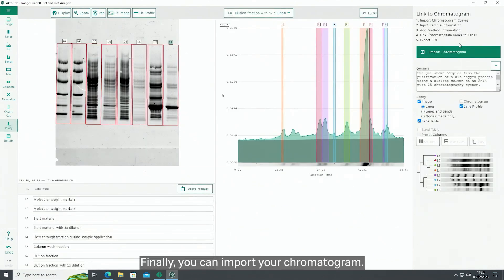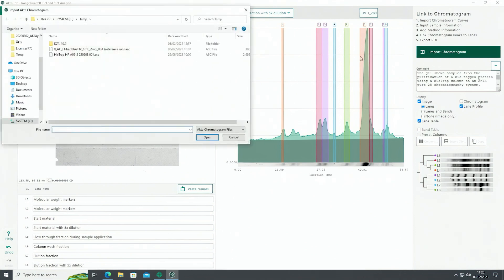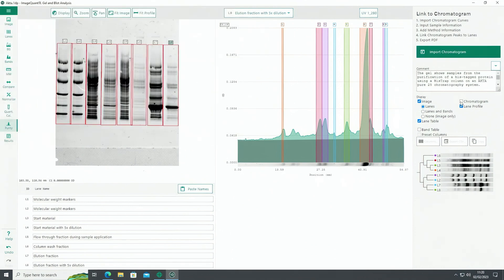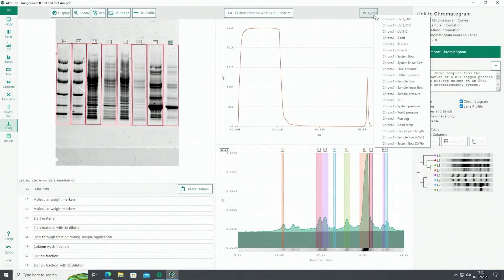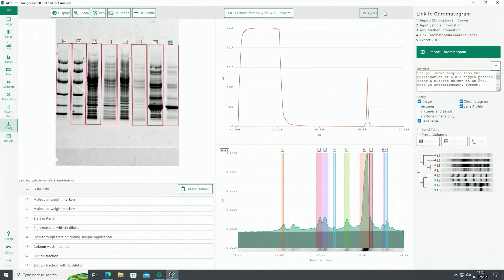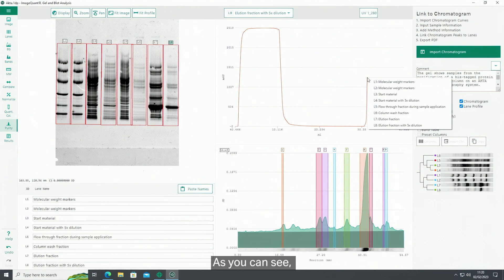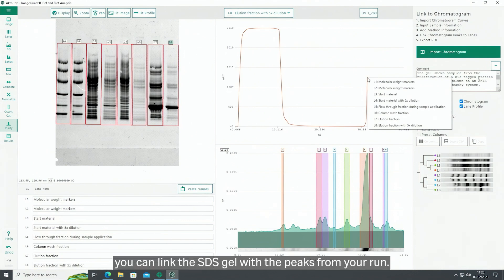Finally, you can import your chromatogram. As you can see, you can link the SDS gel with the peaks from your run.